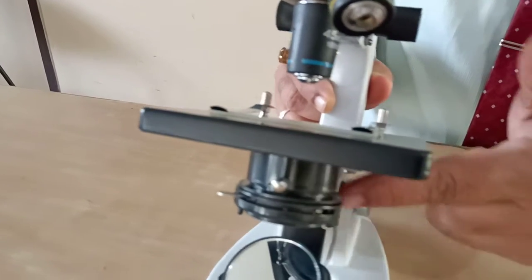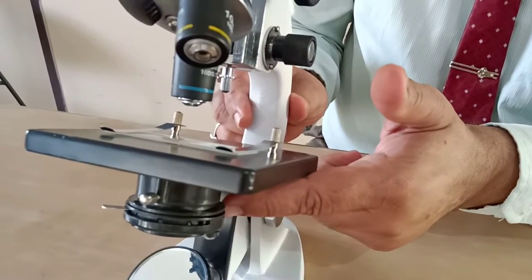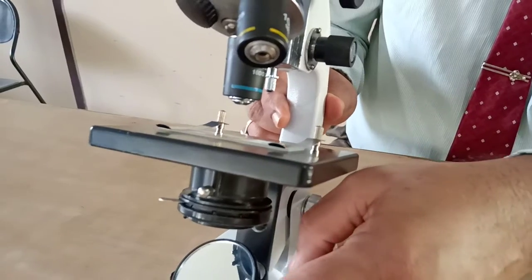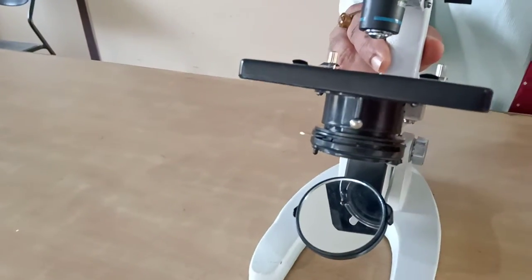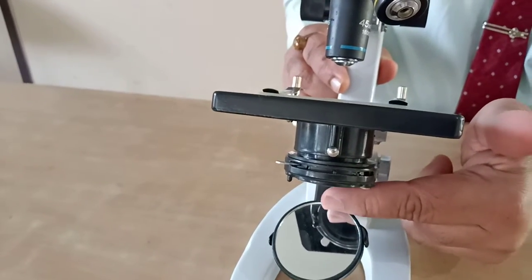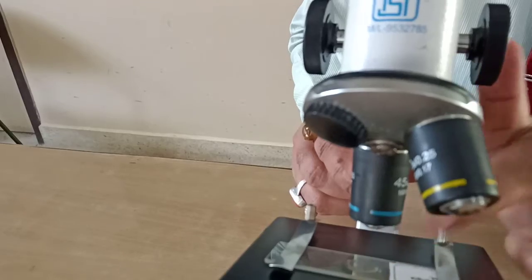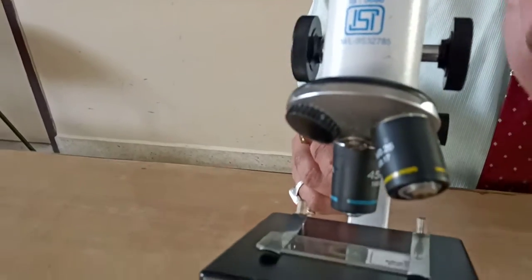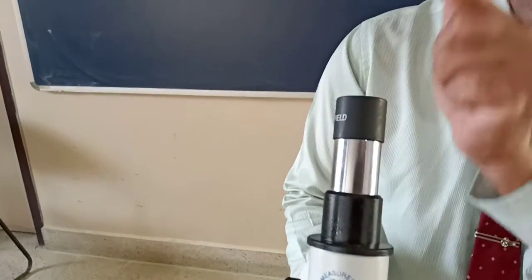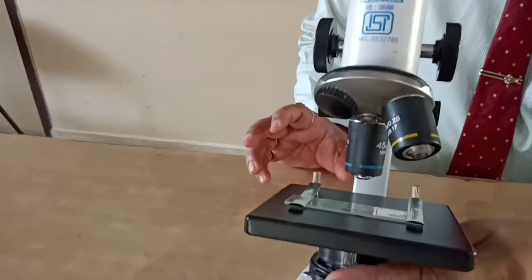This adjusts the light rays. Light rays are reflected by this mirror, then pass through the diaphragm. They strike the slide, then the objective lens, and then the eyepiece. Then we can visualize the object over here. So the diaphragm has a lens.